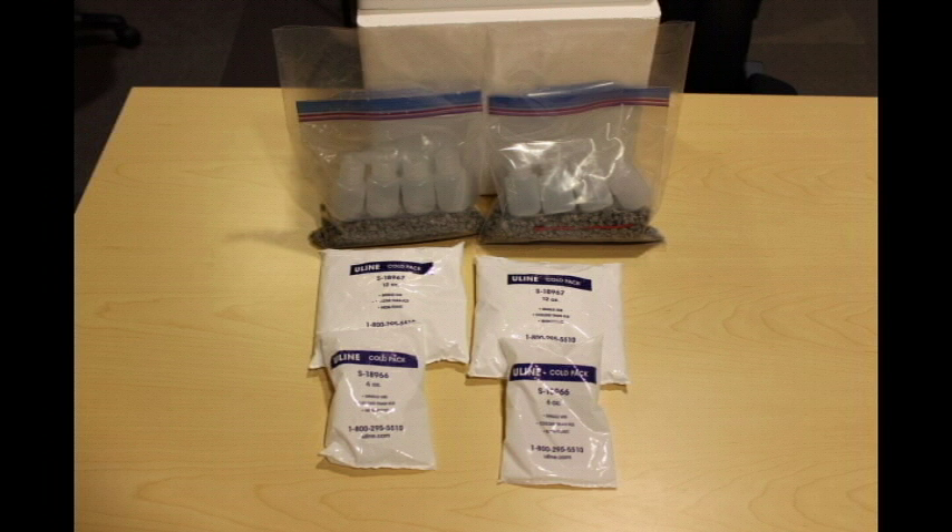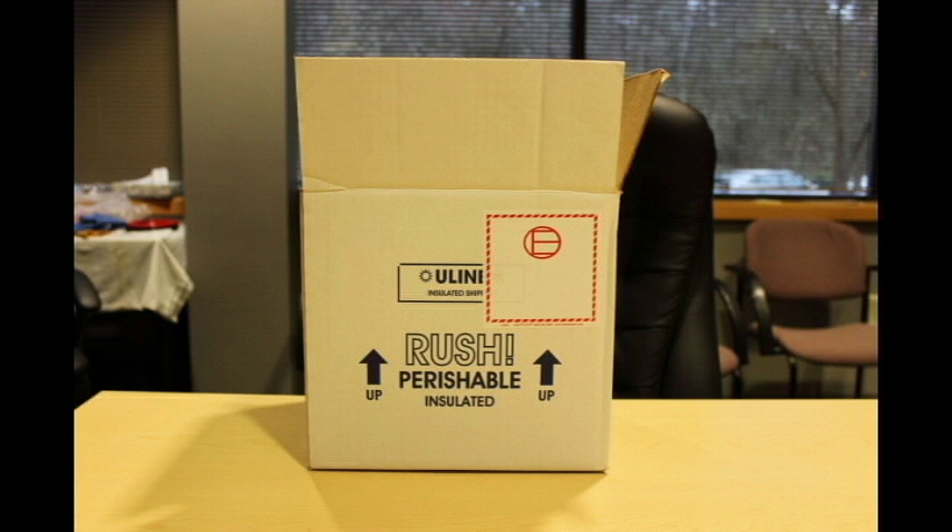The following will be provided as your shipping kit: the shipping container, which is the styrofoam cooler and the box; primary containers and packaging materials, including the plastic bottles, bags, closures, and sorbent. You may or may not be provided unfrozen ice packs with the kit. You will also have included the exempted quantity label, which you will need to affix to the outside of the box.